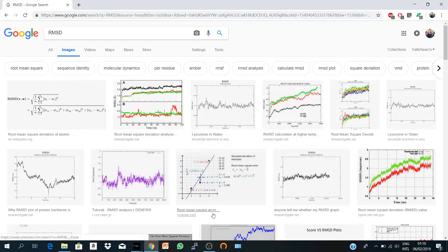Hi everyone, in this video together we will learn how to calculate the RMSD of a trajectory file using VMD.